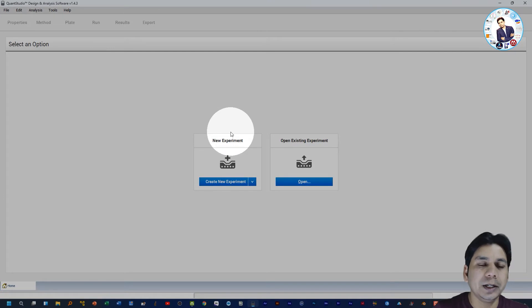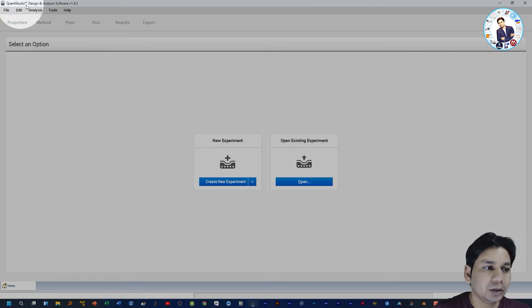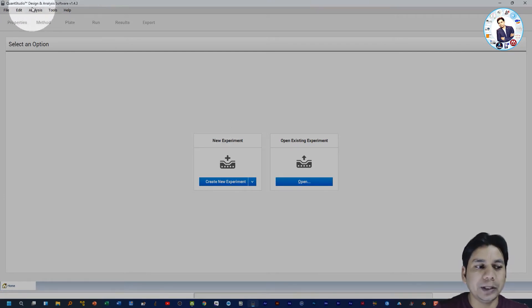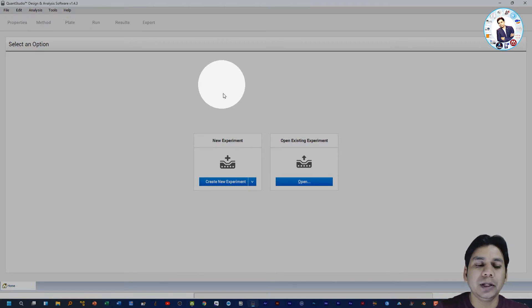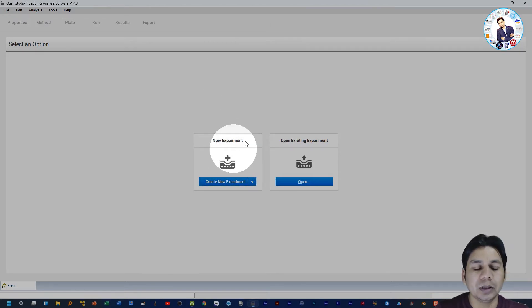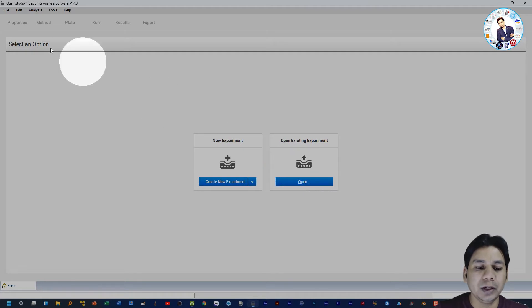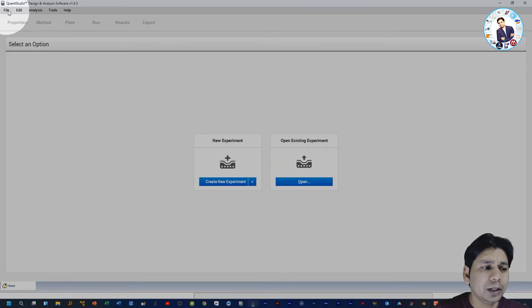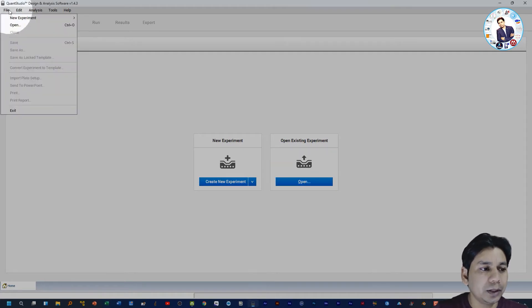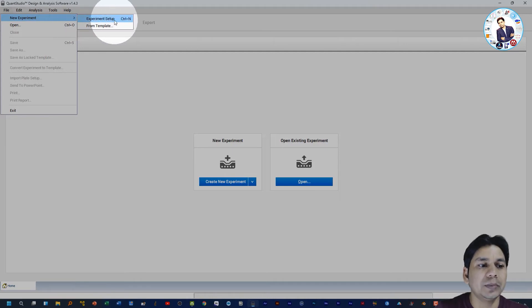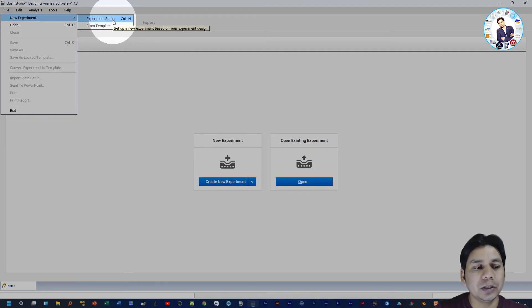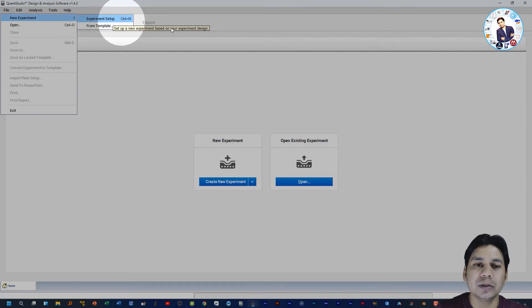Here you can see the interface of the QuantiStudio Design and Analysis Software version 1.4.3. To create a new experiment you can click here, or you can open an existing experiment, or create a new experiment by clicking on File, then New Experiment, then Experiment Setup. You can also use the shortcut key Ctrl+N to create a new experiment.